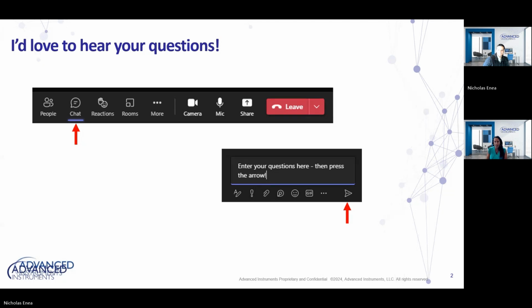This topic of pipette tolerances is definitely something that we are intimately associated with, because sometimes we have customers that will transition from utilizing external pipette calibration services to bringing pipette calibrations or verifications in-house. And one of those first questions that we receive is, what type of tolerance should I be assigning to these devices? And so we're very pleased to bring this valuable information to you.